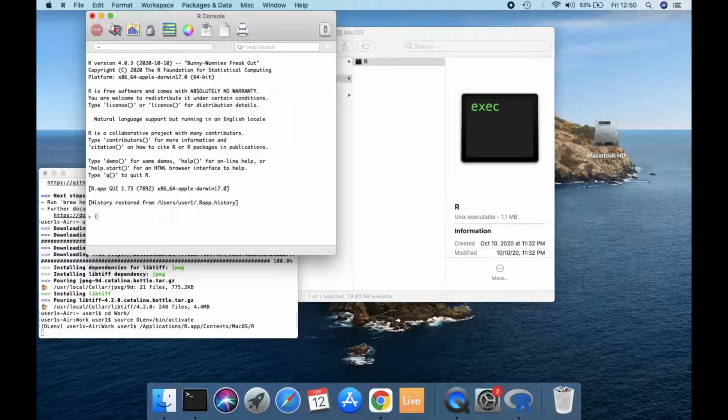So we're going to first install the packages that are used to be able to run R in the Jupyter notebook. So we use install.packages. You can use the tab to autocomplete. install.packages is a command in R that is used to install libraries, packages. They're called like this in R. So the name of this is IRkernel, with capital letters IR, and then kernel. And it has to be between single or double quotes to be installed. So now that everything is typed in, I can hit enter.